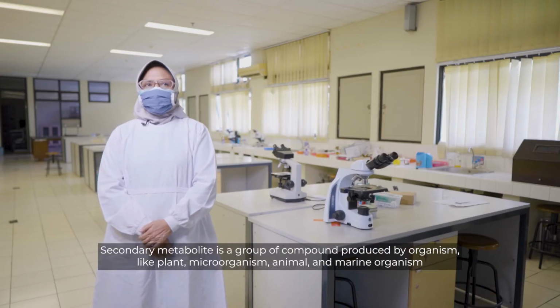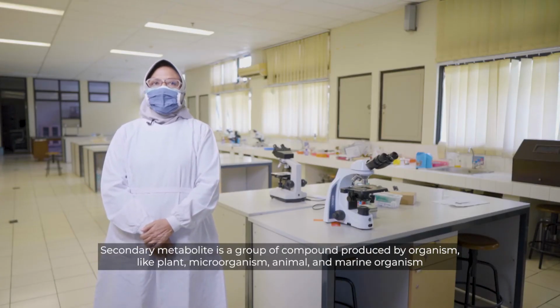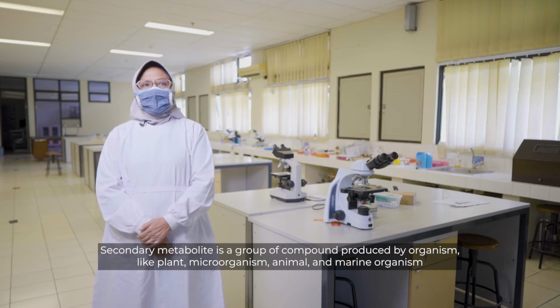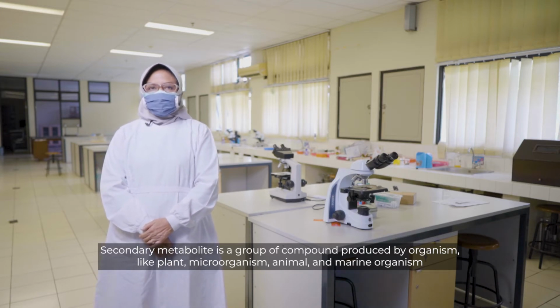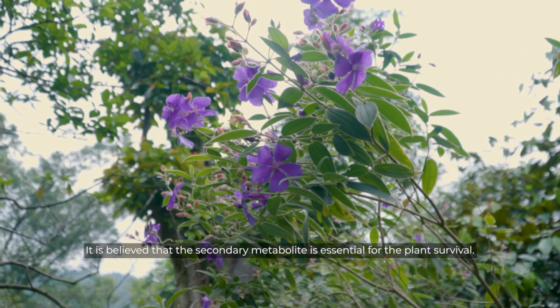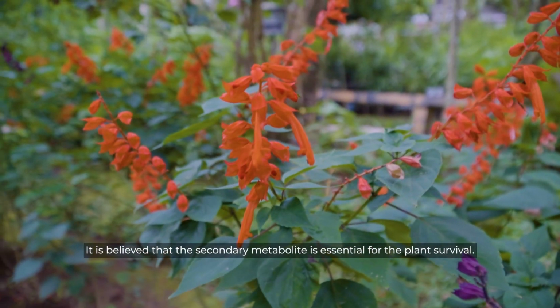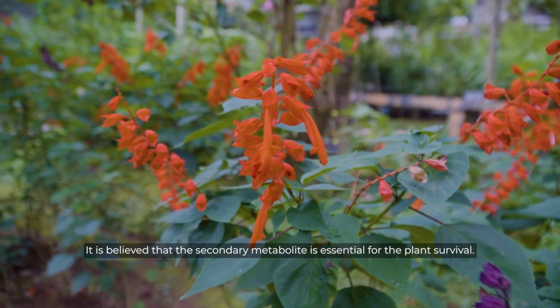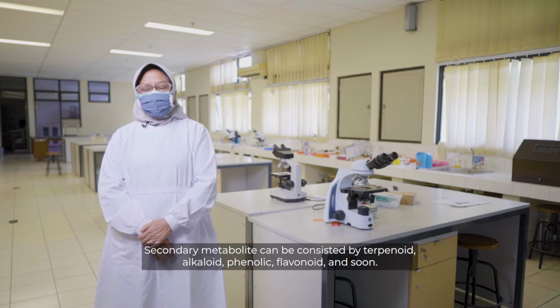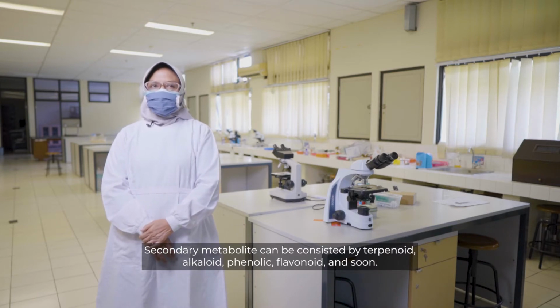Secondary metabolites are a group of compounds produced by organisms like plants, microorganisms, animals, and marine organisms. It is believed that secondary metabolites are essential for plant survival. Secondary metabolites consist of terpenoids, alkaloids, phenolics, flavonoids, and so on.